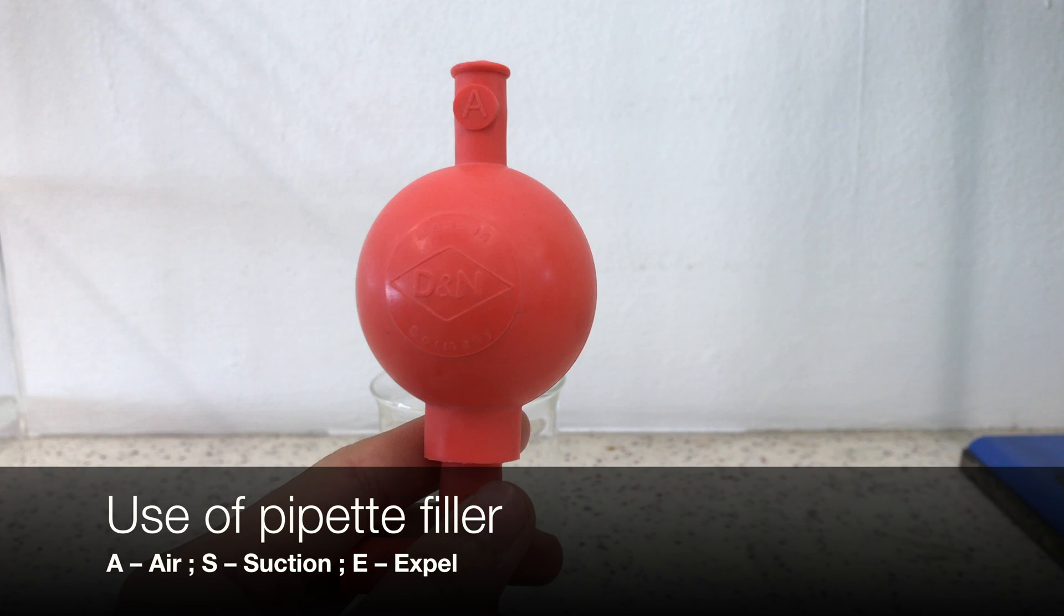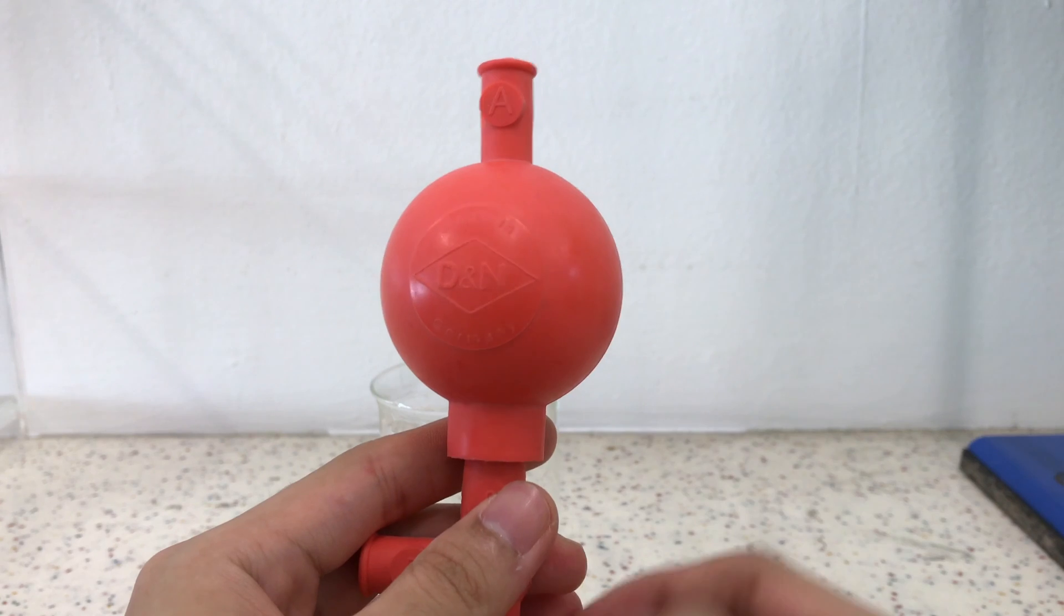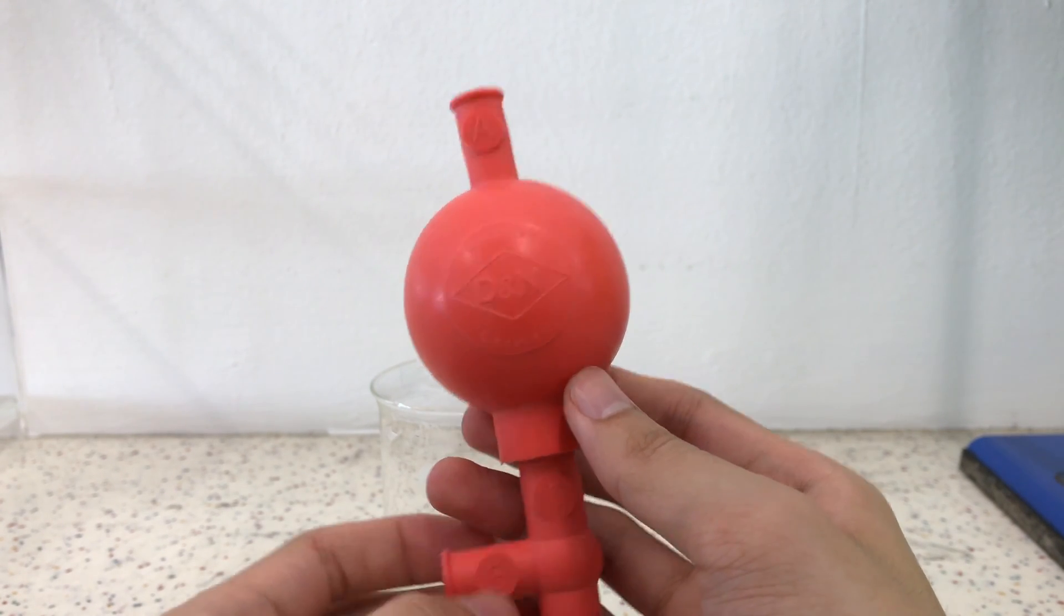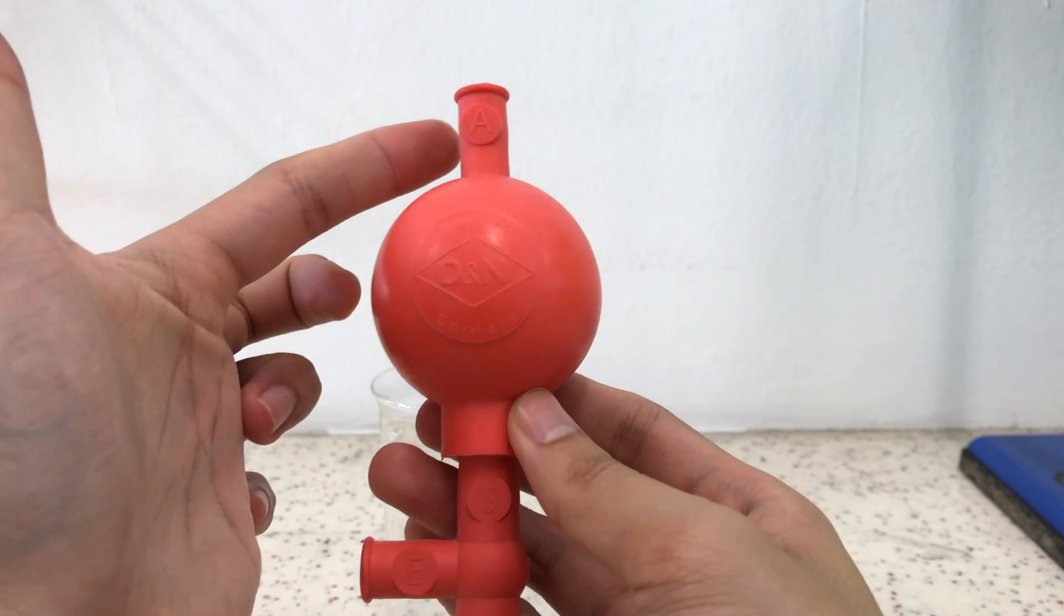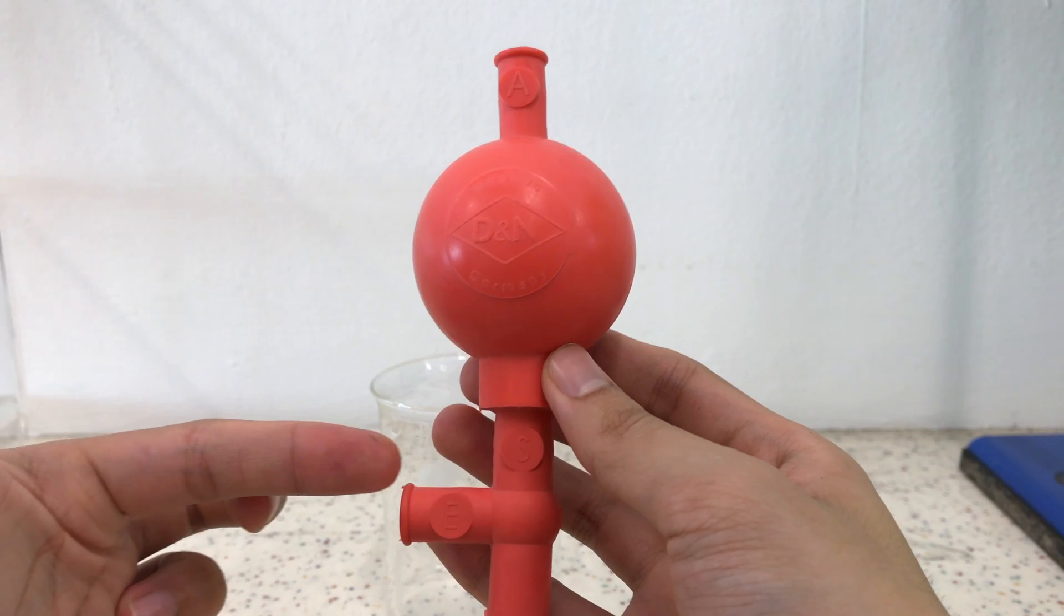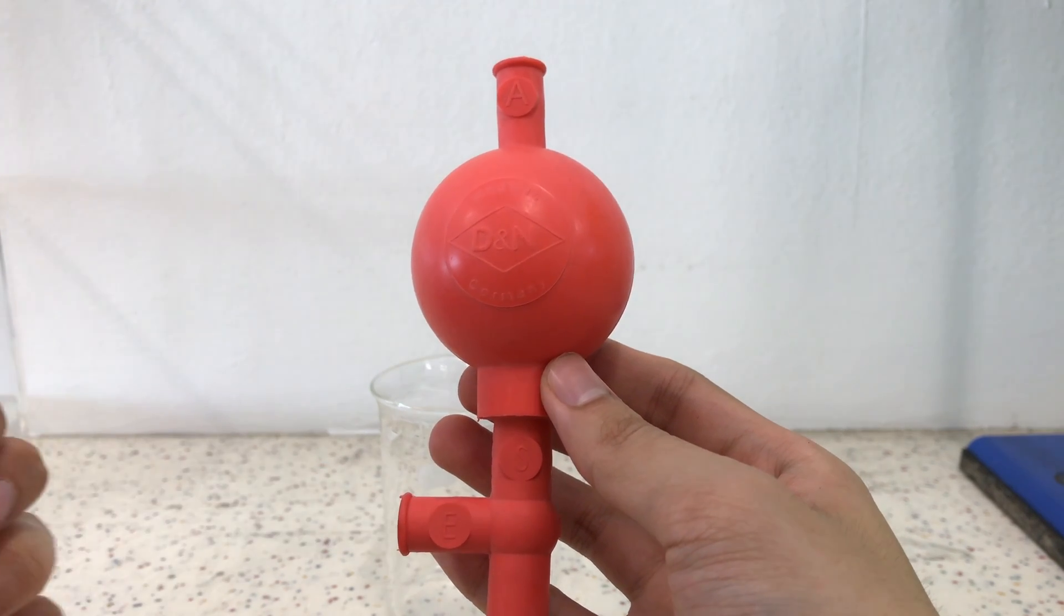Let's look at how to use a pipette filler. There are three buttons: one that says A for air, one that says S for suction, and the last one says E for expel.